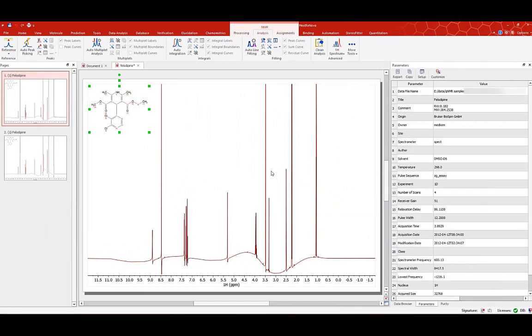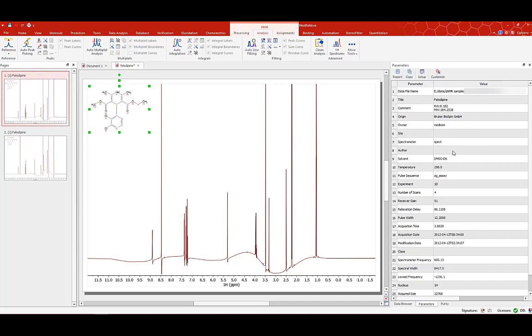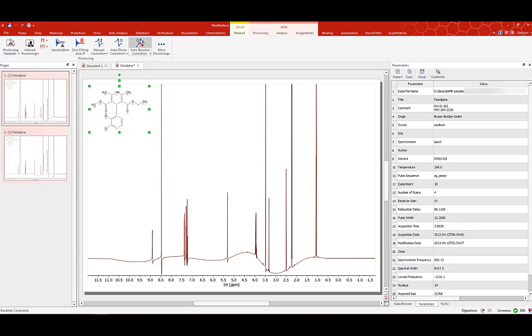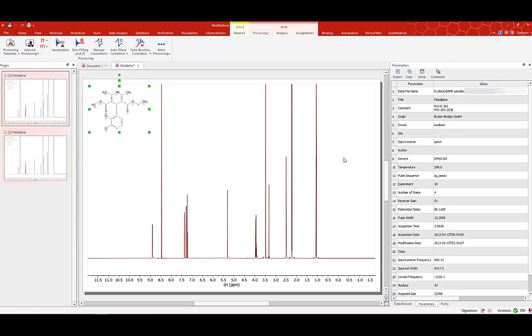Hello! Did you know how easy it is to do QNMR with EMNOVA? I'm going to show you some tricks. So we have two experiments — two repeats of the same molecule — and we have here the parameters for each experiment with the metadata. It is very easy with EMNOVA to process the spectra. Automation really works great and just by clicking a couple of buttons you can have both spectra processed.